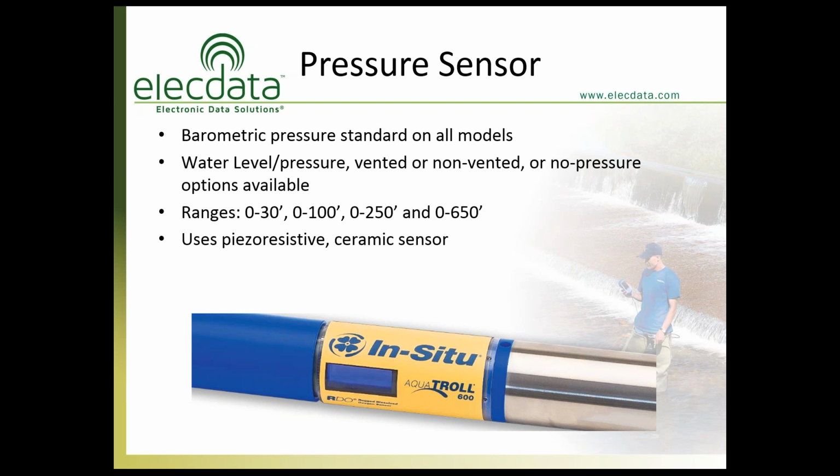Worthwhile point, because there's a lot of people that don't use an internal sensor, that your percent saturation data will actually be tied to the barometric pressure that was in place at the time of calibration, or if they got to the site, sometimes they give the ability to enter a local barometric pressure at that time.